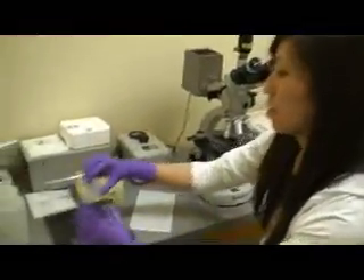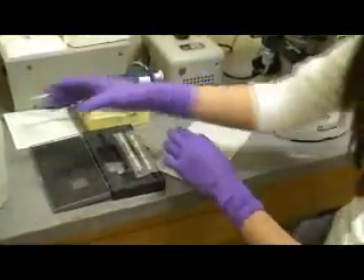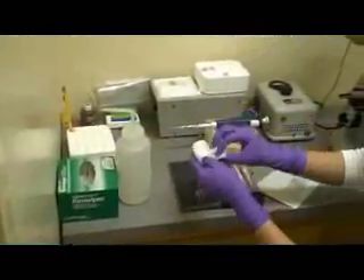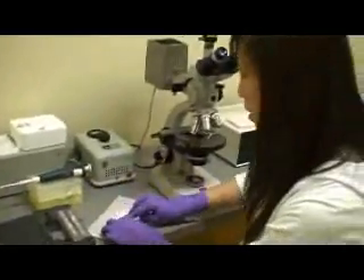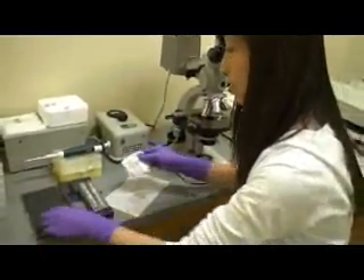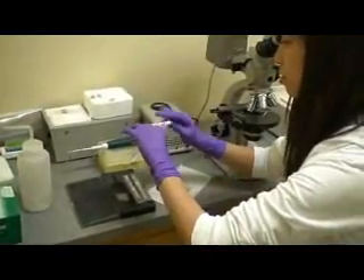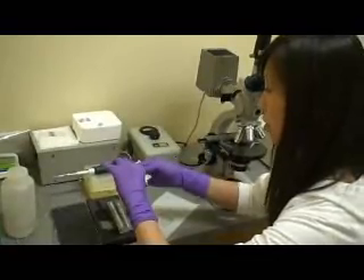So to begin, in order to count the cells accurately, you have to clean the hemocytometer first. You take the chem wipe and use a little bit of the 75% ethanol, wipe it down, and also clean the slide. Make sure that the ethanol dries up before you begin injecting your sample into the hemocytometer.